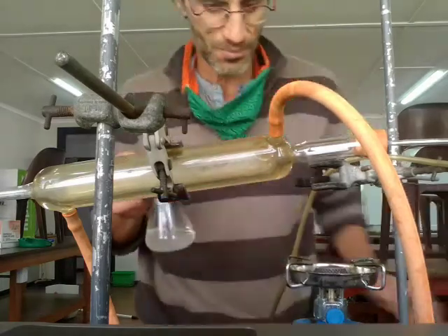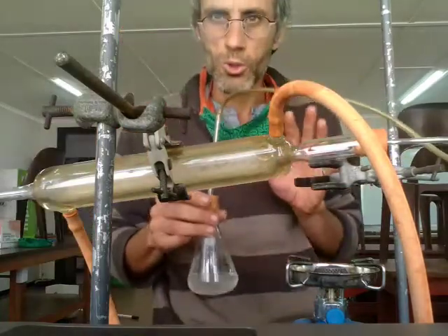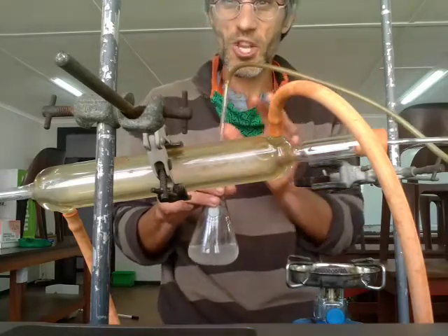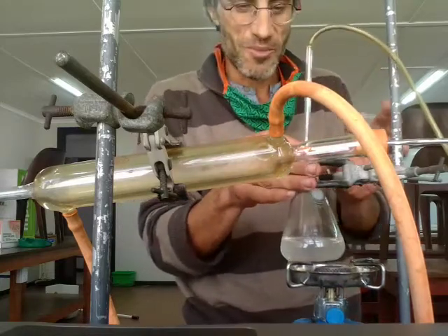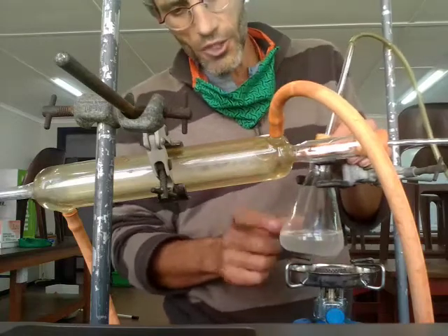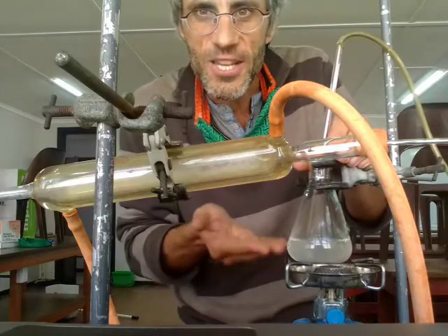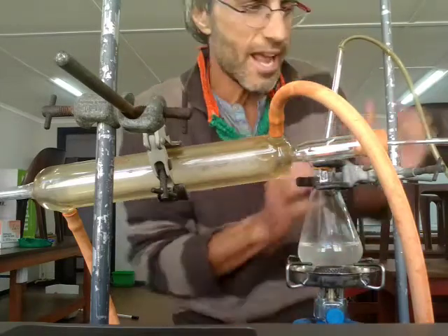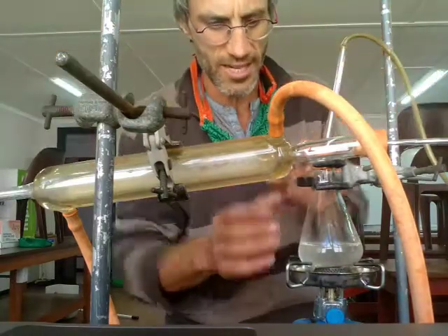How does that work? I'm going to explain what we'll do, and then I will do it. It will be a bit more difficult to video what I am doing. I might even have to send you a little video of it. But let me explain what I'm going to be doing. I've got the salty solution here in the conical flask. I'm going to heat it. I've got a gas stove underneath and a stand. These two are called the stand. They're just holding things together.